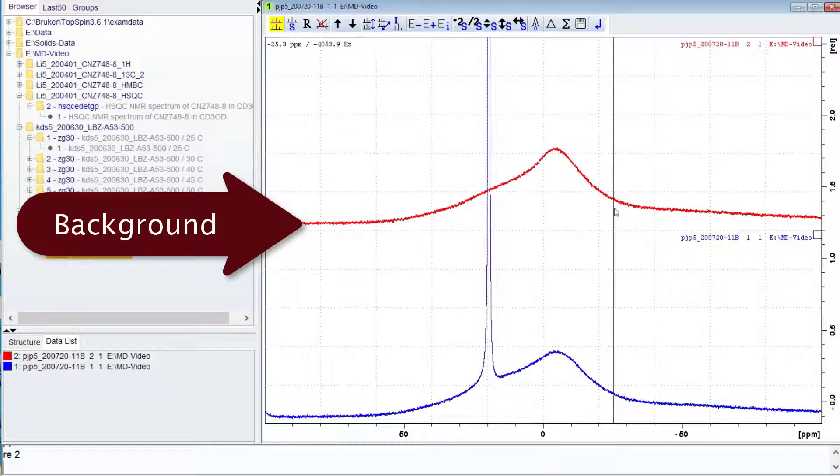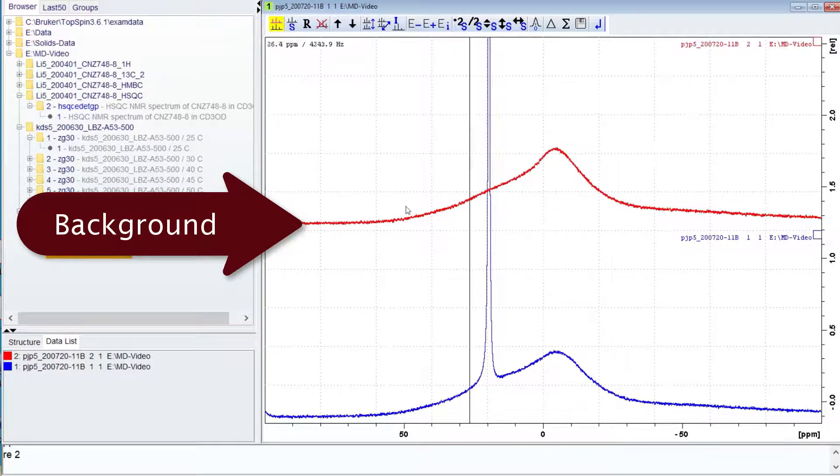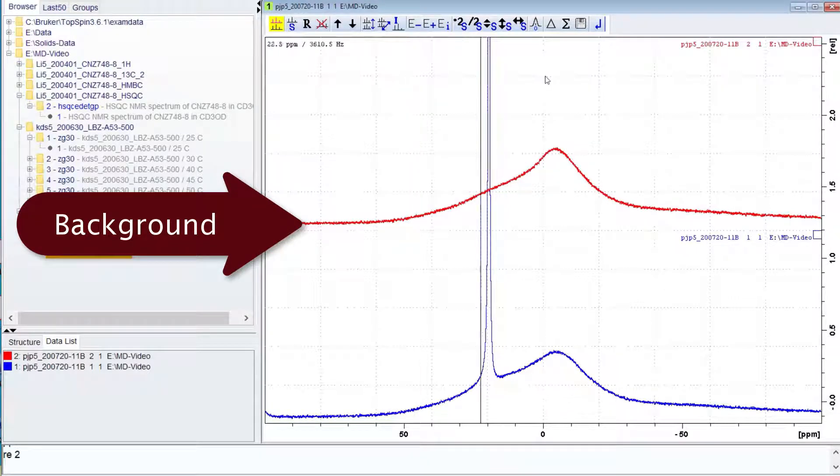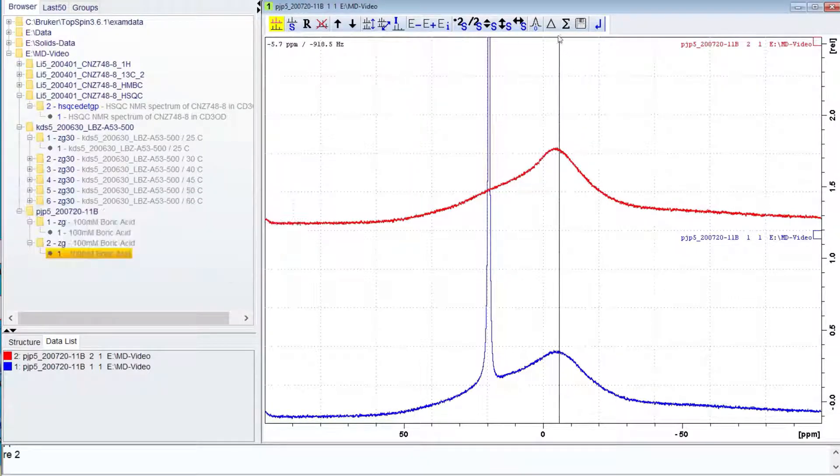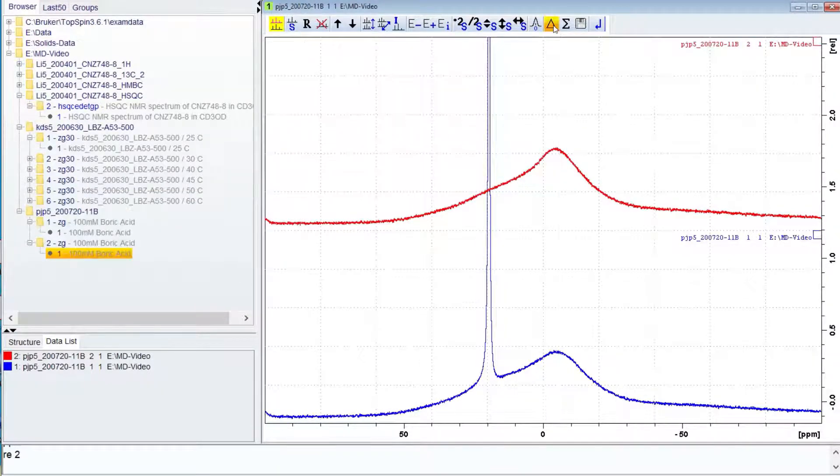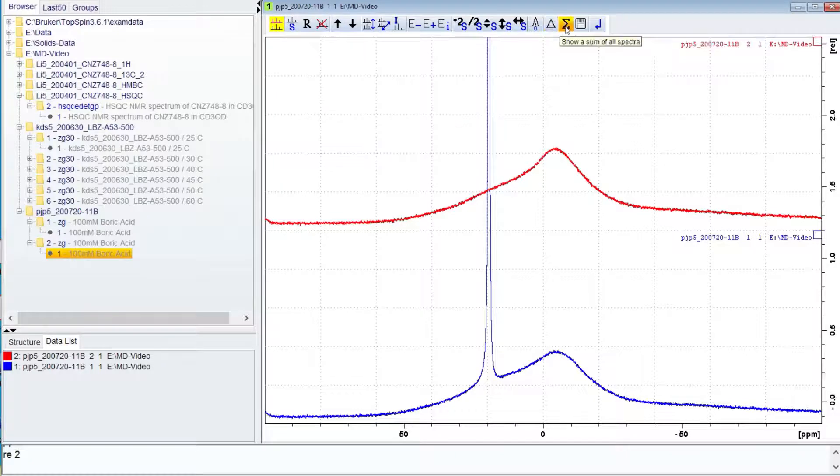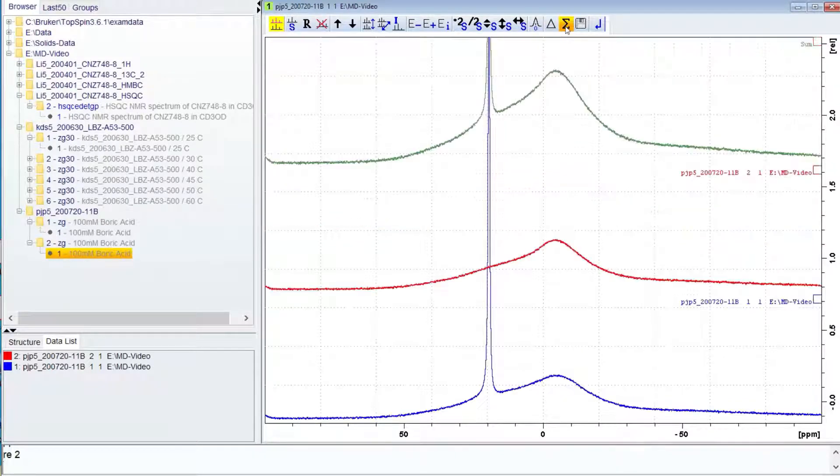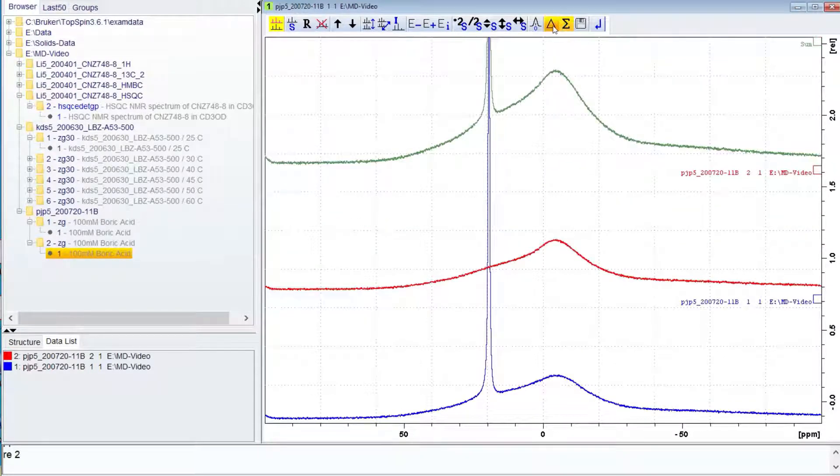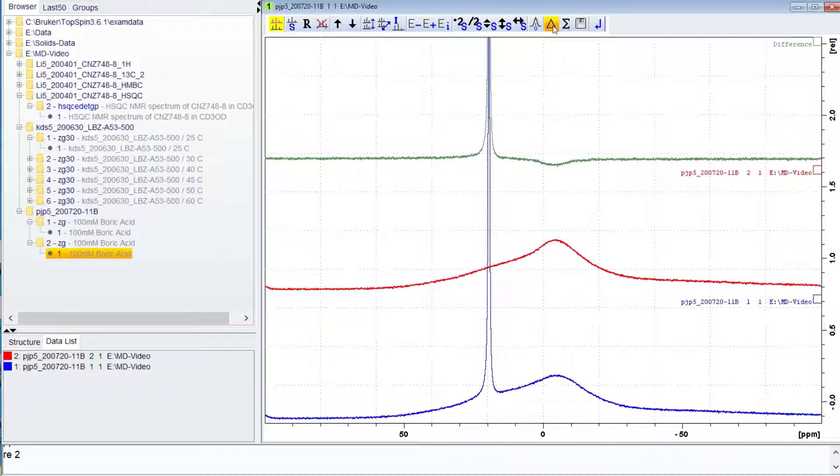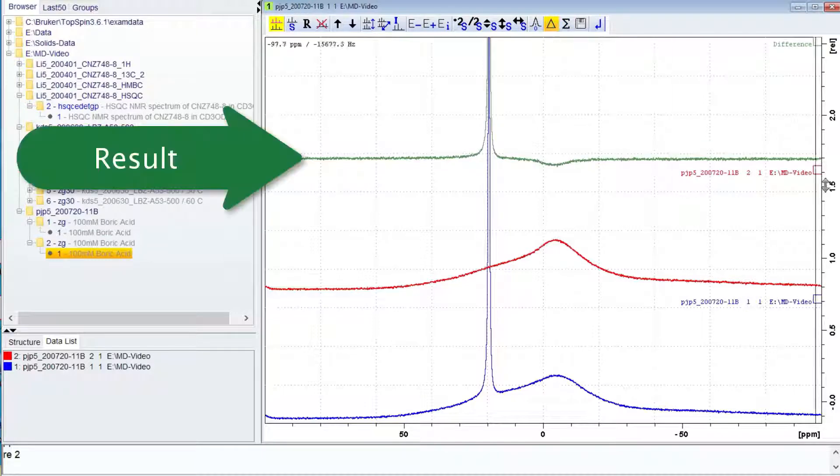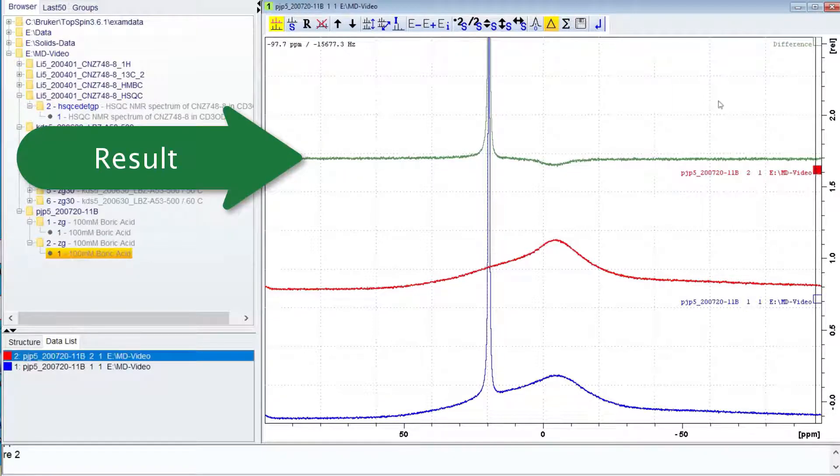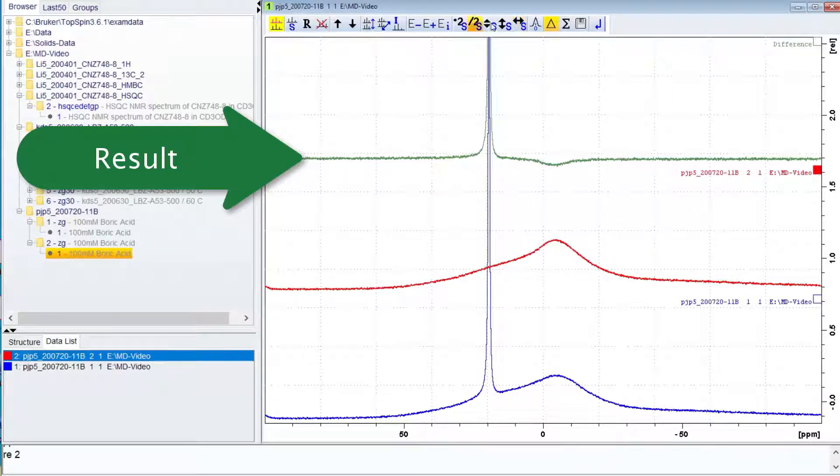In multi-display mode, the button with the delta icon is the difference mode and the button with the sigma icon is the sum mode. When you click on either button, a third trace will show with the result. Here is the spectrum with the background subtracted from the boric acid spectrum.